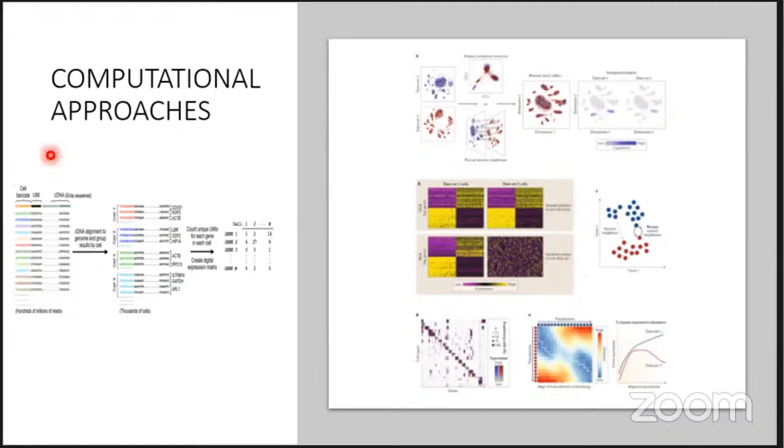Suppose I am taking a blood sample. In my blood we have different kinds of cells, like RBCs, monocytes, eosinophils, lymphocytes and so on. Now when we have single cells, we barcode each cell with different barcodes, so these barcodes can identify each type of cell. We get the data like this, and then in the second step, we cluster the reads depending on the cell types.